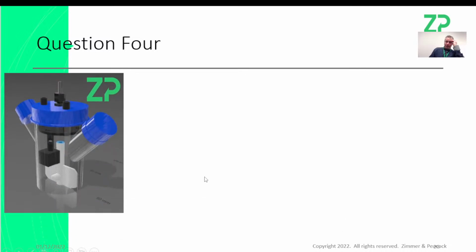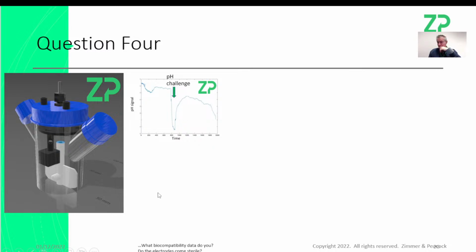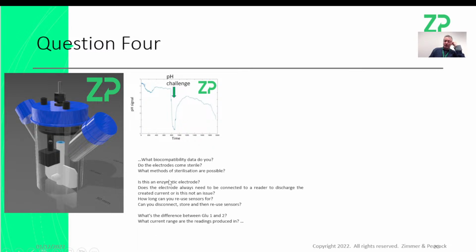Question number 4 is, I have mentioned it, we are, for example, putting our biosensors into bioreactors. What we're specifically doing is putting our biosensors into bioreactors that are being used with stem cells. And we have a couple of sites around the world. Today I'm sitting in Norway, but next week I'm on the Coventry site, and so Coventry is on the Warwick campus.